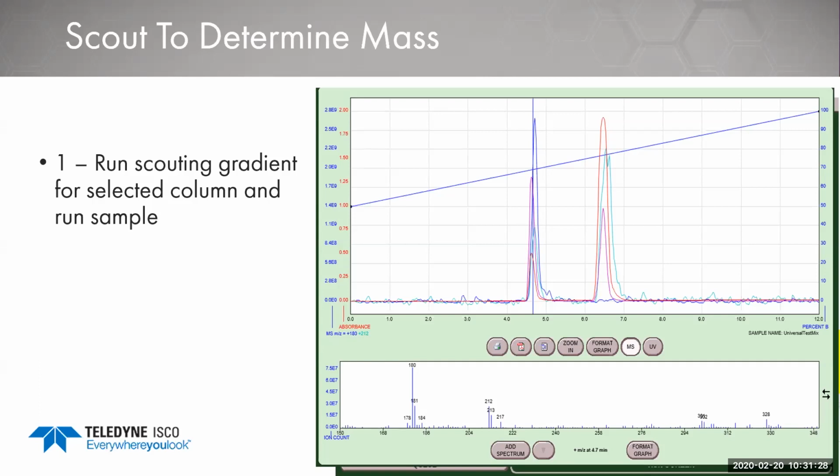If we have an obstruction on our capillary going into the mass spec or the tubing, our instrument actually has a valve on the front of it so that we can actually introduce sample, so that you can actually see what material you're looking for before you ever actually run it. If any of those little components have a blockage in them, you're going to see high pressure there. Usually it's going to be in the tubing or the capillary itself that we put our line into.